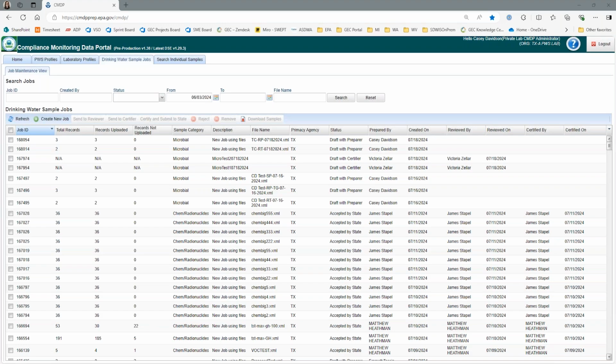can report data. All labs can report data at any time, essentially, and then CMDP will be running downloads on a frequency, and then those will be imported into our SIDWIS for compliance officers to be able to review and do compliance on. So at least right now from a data perspective, there's not a requirement to do daily or weekly or what have you. It would be just to submit the samples in accordance with whatever the regulatory requirements are.